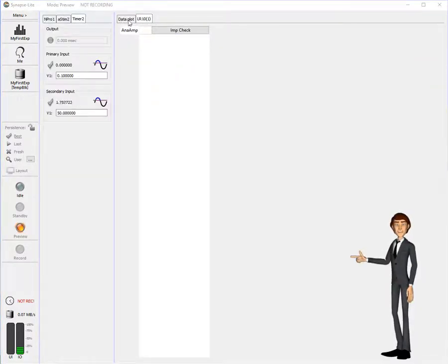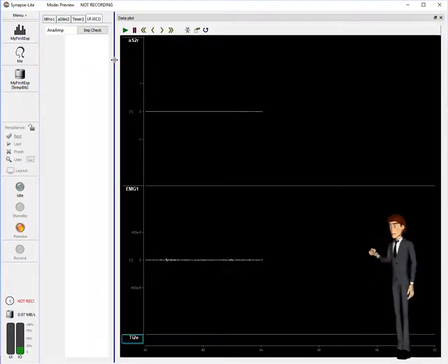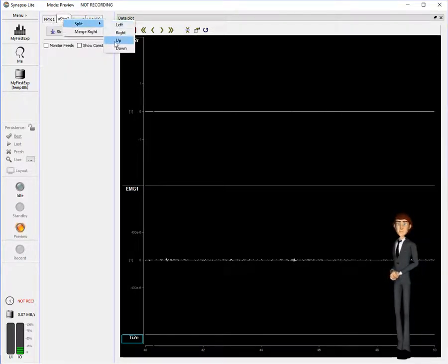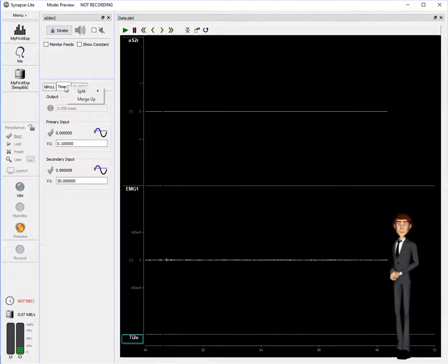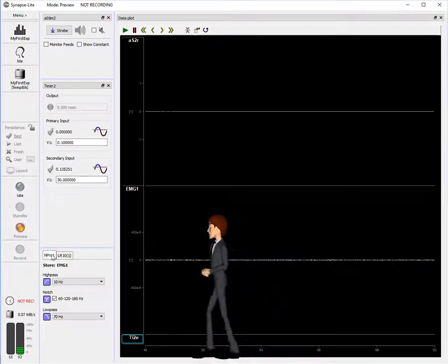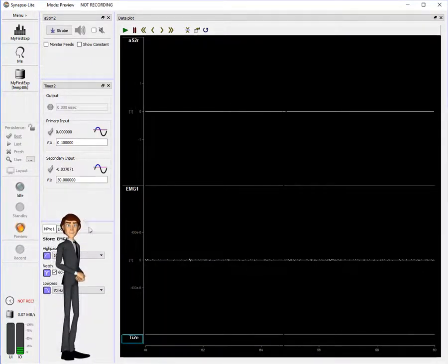I like to keep my control windows organized to the left. Right-click, and choose a split option, to unstack tabbed windows, as I'm doing here. Windows can be positioned any way you like, and the setup will be saved in the database and reloaded next time you run this experiment. I'm almost done, then we can fire off the audio stimulator and run the test.